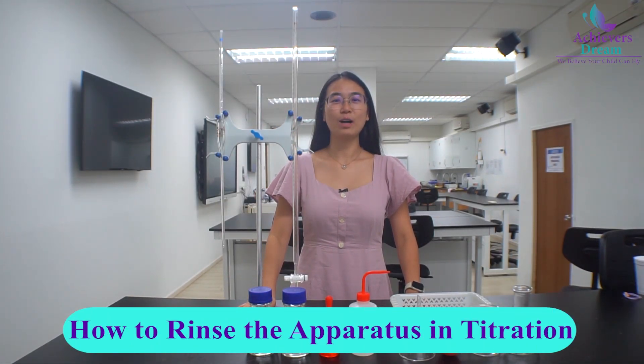Hello! In this video, I will be demonstrating how to prepare the burette and pipette for the titration experiment. We need to rinse both apparatus with water followed by the chemical solution which they should contact.